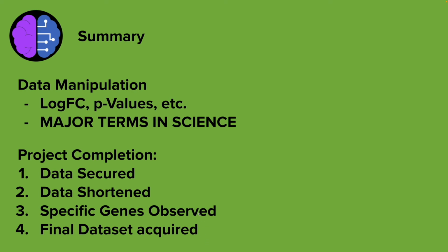Now, I will be linking the final data set that I am going to be using below, but you can just follow the method that I had discussed to create your own data set. But I highly recommend using my data set just so you can follow along and you don't have any extraneous data. Now, upcoming for the rest of our project, we're finally going to be getting into the programming. We're going to be discussing Python, machine learning, logistic regression, all sorts of really fun stuff that is really at the forefront of technology in today's world. So I'm really excited to get started with that with you guys.